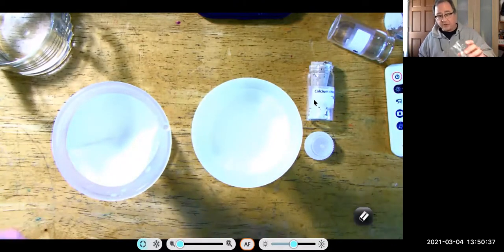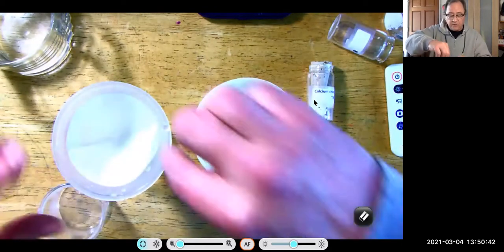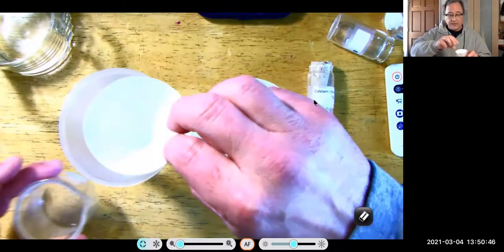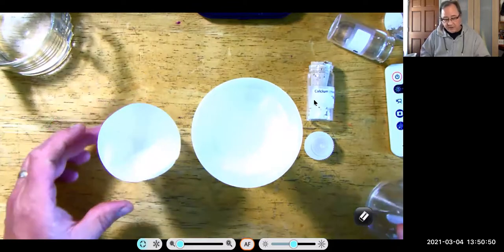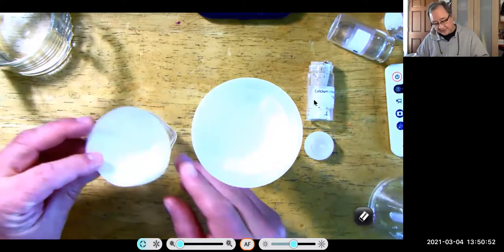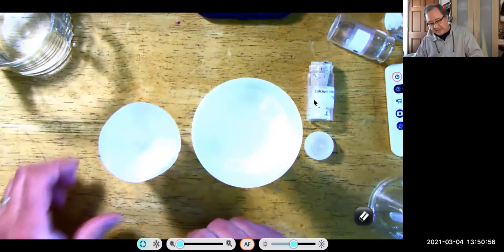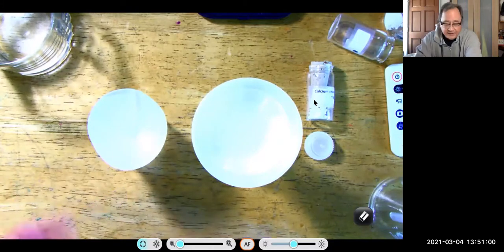Well, if you get one of your beakers and clean it out, you can remove the filter paper and actually put it in your beaker like so. You see, by placing it in my beaker like this, I make sure that none of the solid's going to pop out. And I can put this in the oven at 200 degrees for about an hour.